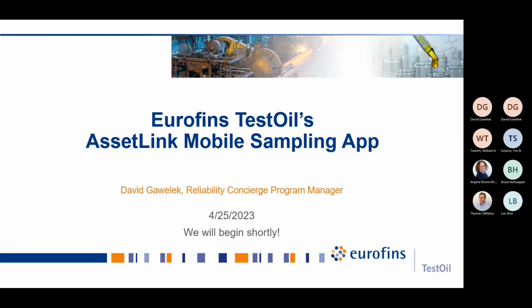So to start, I want to say thank you for attending and thank you for your interest in Eurofins TestOil's AssetLink mobile sampling app. A little bit of background on this app and why we developed it. We'd had some versions of this app in the past that carried out the function of linking sample bottles to database information around machines, but we've spent the last couple of years taking in feedback from you, our customers, and after a lot of conversations, we decided we wanted this to be a little bit more.